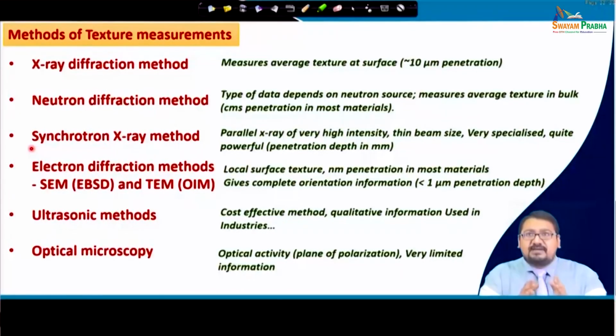Its wavelength lambda is lower than the wavelength lambda of normal X-rays, and X-rays are actually divergent beams, but as the intensity of the synchrotron X-rays increases, the divergence of that high intensity short wavelength synchrotron beam can be reduced and parallel beams can be obtained.